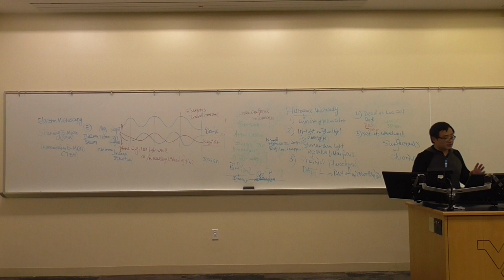This slide, in my other class, I draw separately on the blackboard, but here we just briefly mention it. This is clearly the difference between the light microscope and the transmission electron microscope. You can see what the difference is. So clear. The light field microscope uses light as an energy source. The electron microscope uses an electron gun. This is the number one difference.